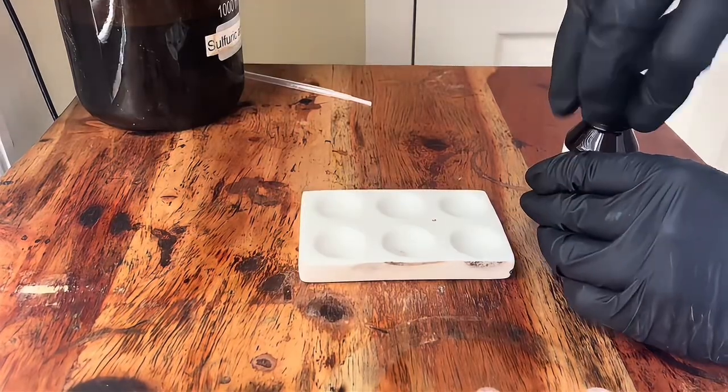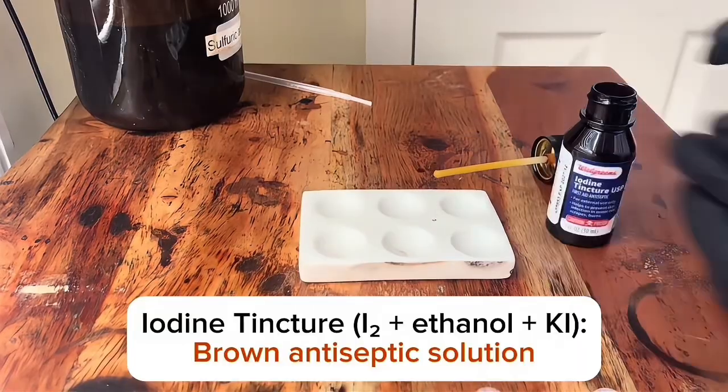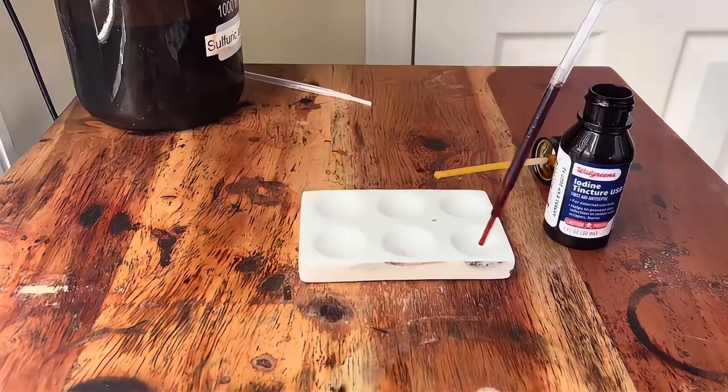Hi guys, today I'm gonna be showing you how to make iodine from iodine disinfectant. First, we're gonna use a pipette to put some of the iodine tincture onto this reaction plate.